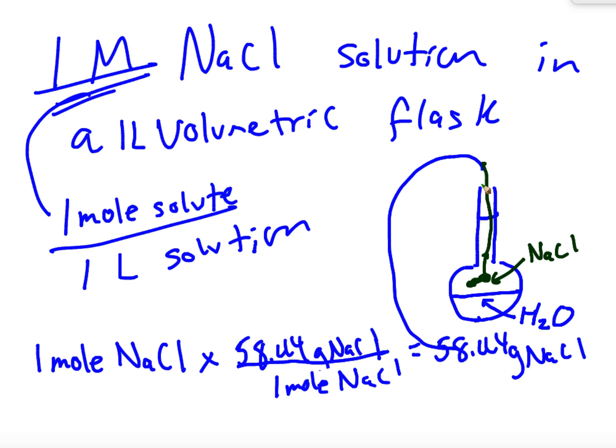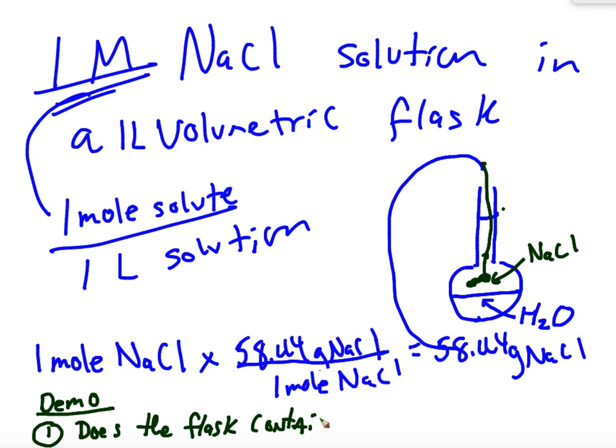Now, your first question you're going to give me an answer to. So this will be the demo. You're going to write on your paper with a line, and then you're going to put number 1. And the question is going to be, does the flask contain a liter of water?